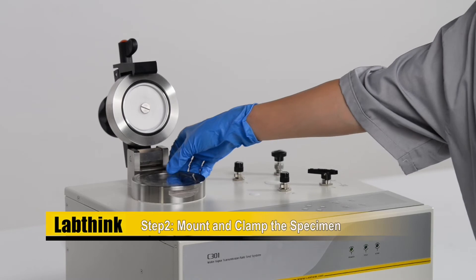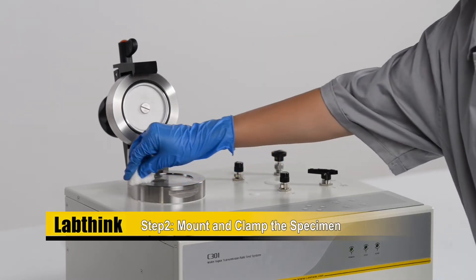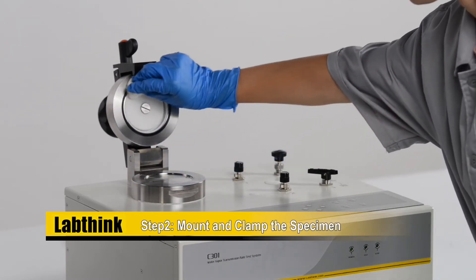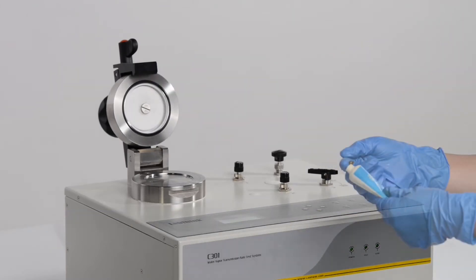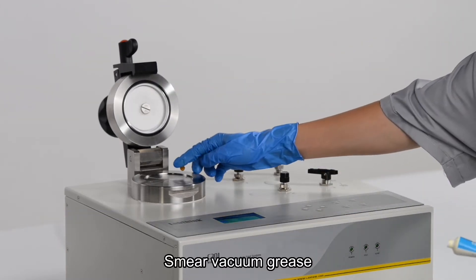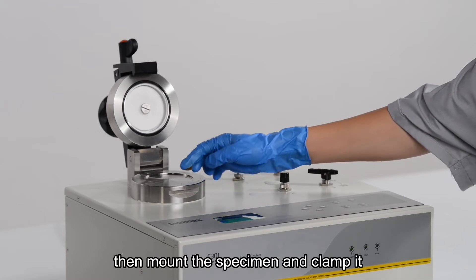Step two, mount the specimen. Smear vacuum grease, then mount the specimen and clamp it.